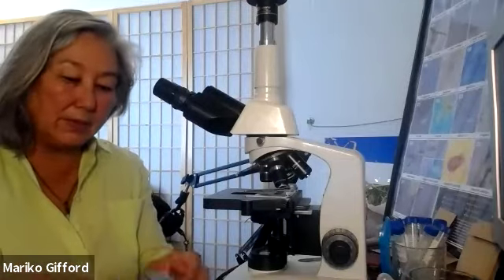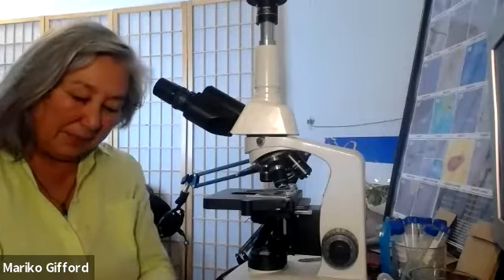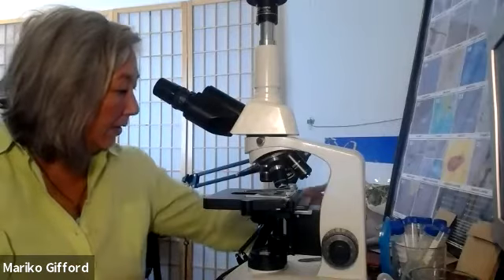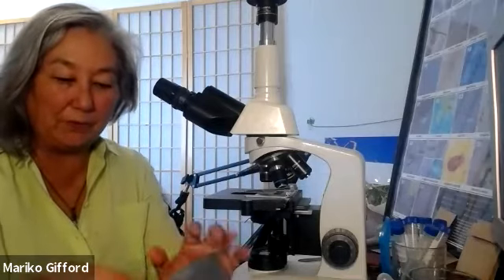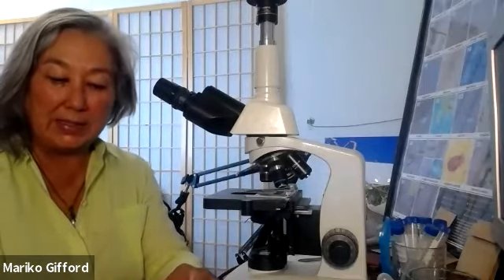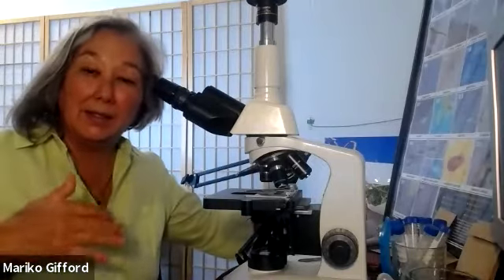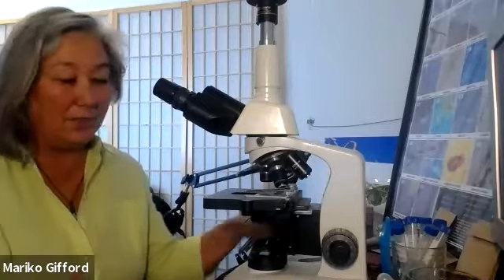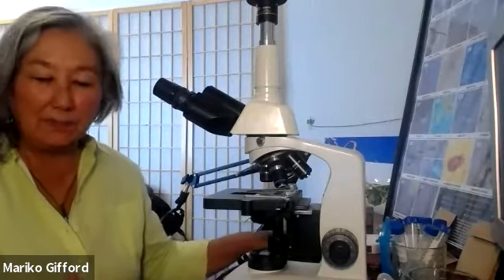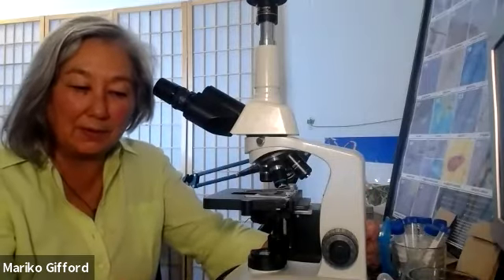And this is a very low-tech tool that's been used in the wine, I believe beer industry as well. In wine, they want to test the sugars. And so it's a refractometer, and we'll have the detail about how it actually works. It refracts light through that liquid, and they've tested it for decades. We've used this, so it's a very reliable little tool.